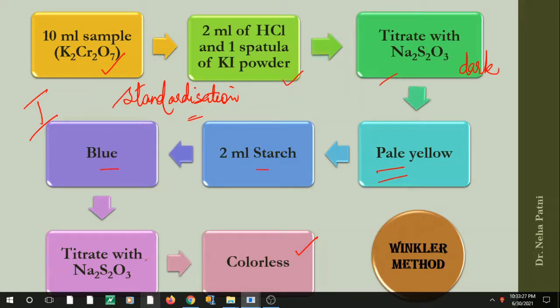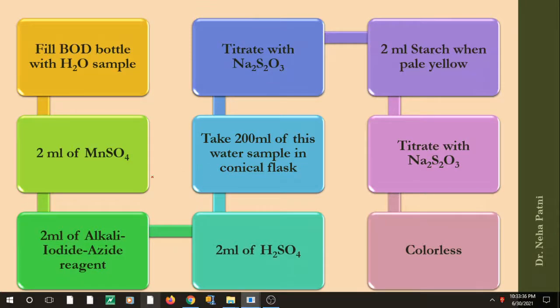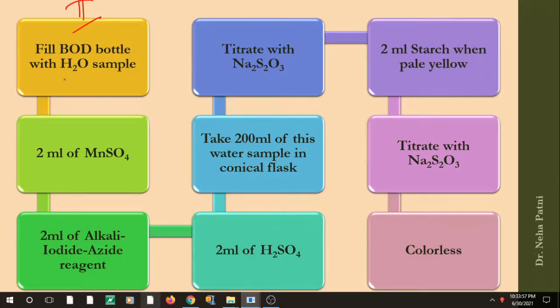Now let us look at the second step. In the second step you titrate with the water sample. First you fill your bottle with the water sample, then add 2 ml of MnSO₄, and also add 2 ml of the alkali iodide azide reagent.